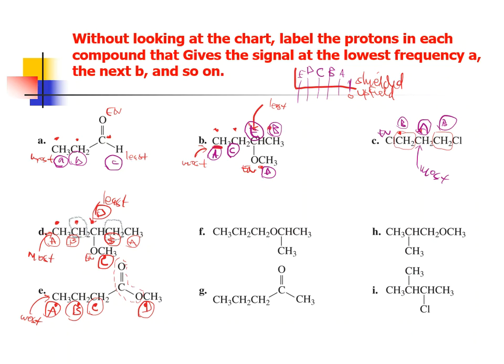All right, next up is F. So I'm going to ding-dong you to death, I think. If we take a look at F, here is the electronegative atom. I just really like to start there. I think it gives me a good starting place for all of this mess. And it looks like I'm going to ding-dong, and then ding-dong, and then ding-dong there. And then on the other side, I have a CH group that really hasn't shown up yet. So ding-dong there. And then off of that one, I see a CH3 group, which is different than that CH.